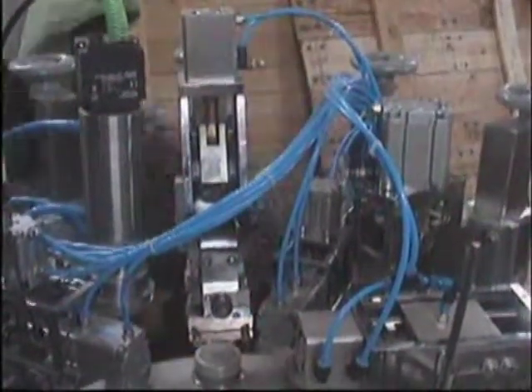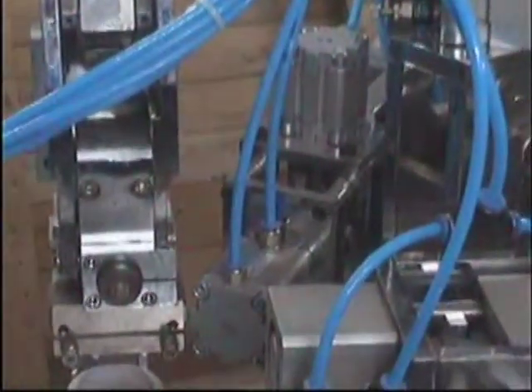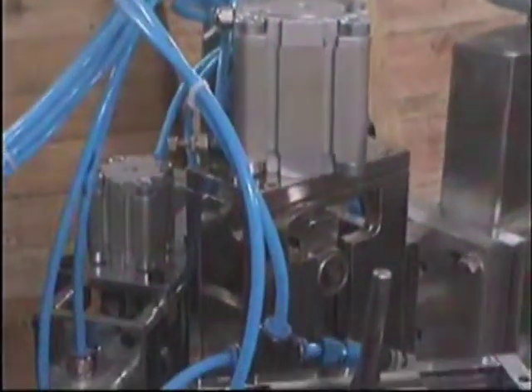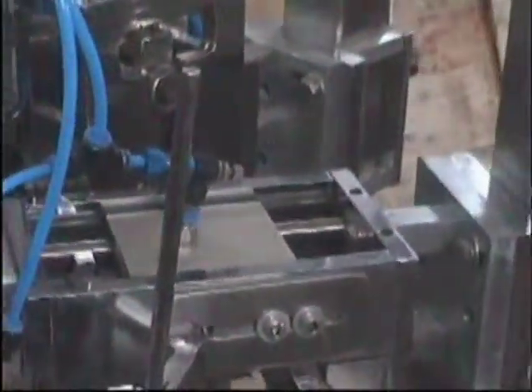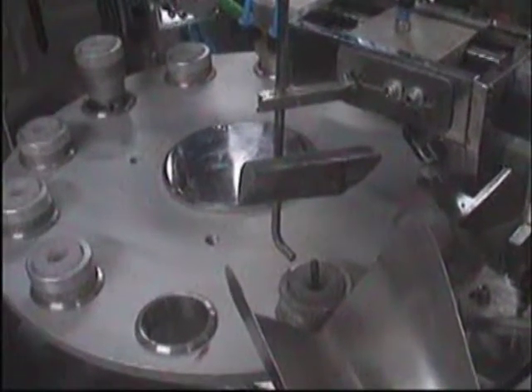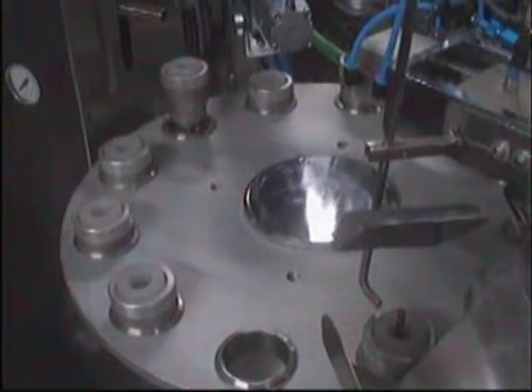The fourth module is the second fold of aluminium. You are seeing two cylinders — one on the top, one on the side, and one at the rear — which ensure the second fold. Immediately after the second fold you are seeing the cylinder for mechanical batch coding. Next to the batch coding system for aluminium is the tool for cutting the lami tube. The filled tube gets ejected and drops through this chute into the container. You are seeing the Geneva mechanism, which works very smoothly without any problem.